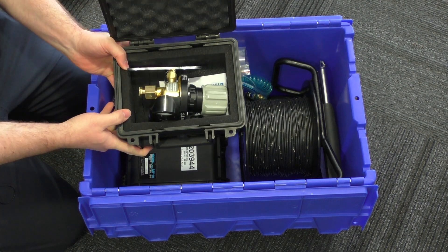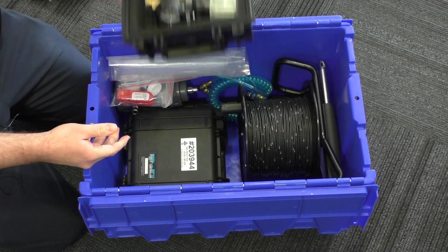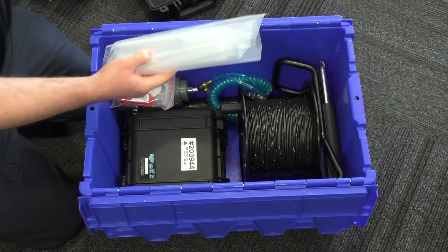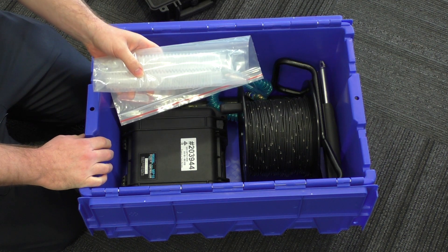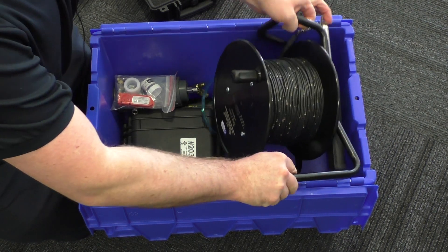We can arrange supply of CO2 cylinders as part of the rental. We supply two bladders with the kit, and more can be purchased depending on how many wells you're sampling.